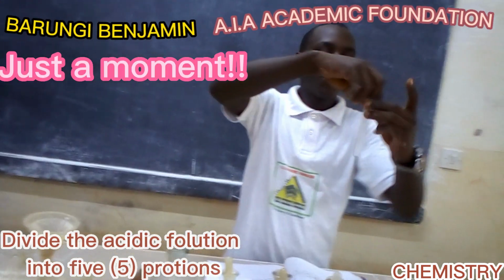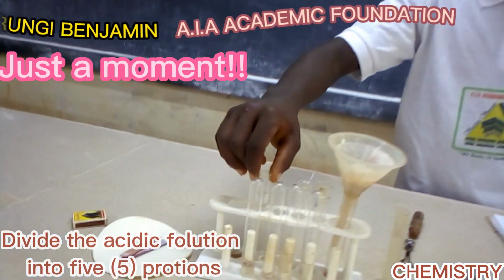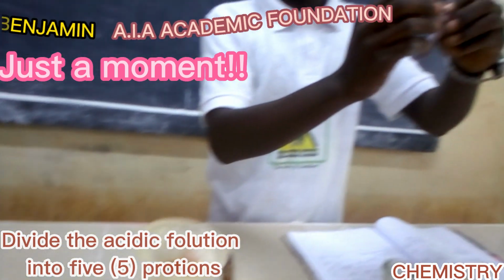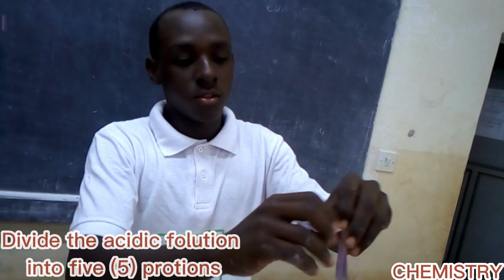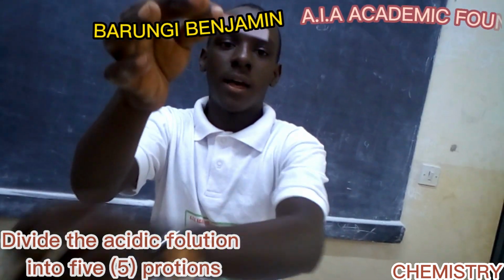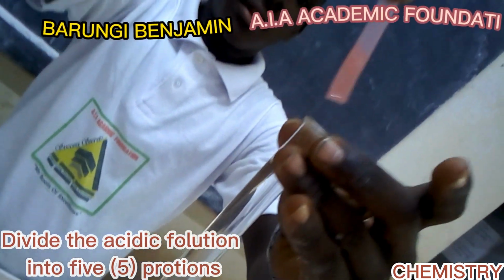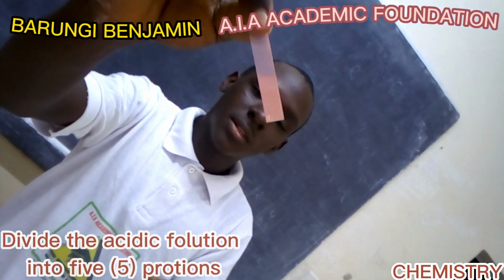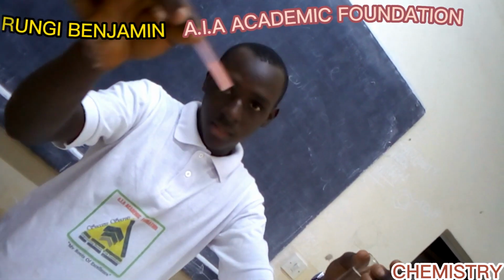So to prove to you that this solution is acidic, I'll test it with blue litmus paper. We normally use blue litmus paper to test for acids. So I'll put my blue litmus paper in the solution I have. You can see it's acidic, which means we have made it acidic.